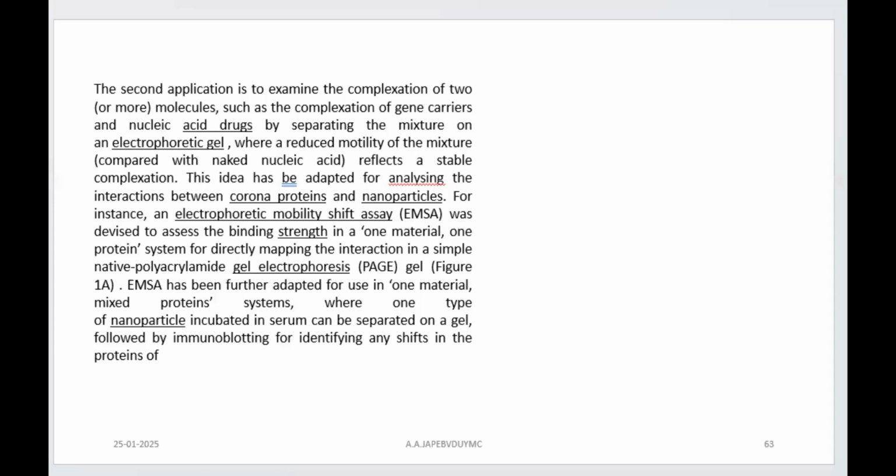So to summarize, I would say you can use electrophoretic processes for applications in molecular biology alone. You can say determination of DNA sequences, Southern and Northern blotting, right? Then restriction mapping of DNA, then DNA footprinting, and also variations in conformation of nucleic acids. They can be analyzed using electrophoresis.